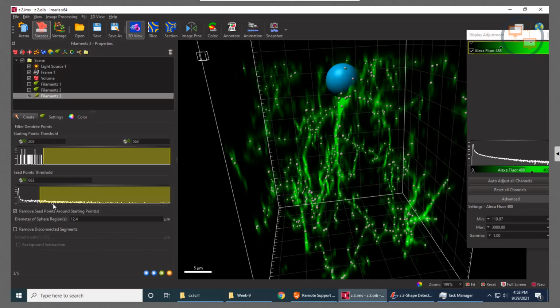It could also give you not ideal results. Changing that value may affect how accurately the filaments algorithm fits your data. So those kinds of questions, whether even the filaments algorithm is the best one for your data, depends on what it looks like. So it's something we'd have to do a consult for. Okay, thank you.